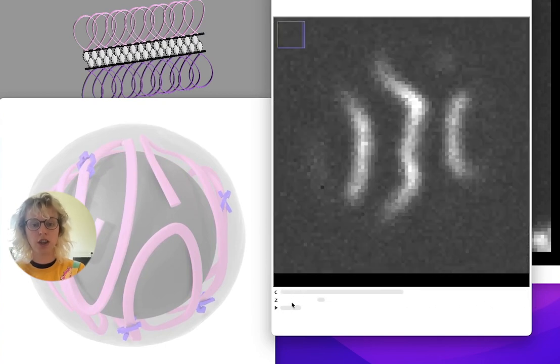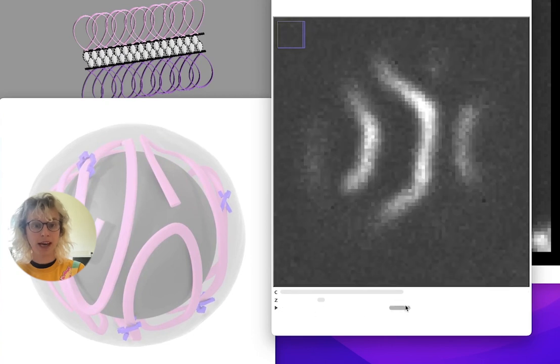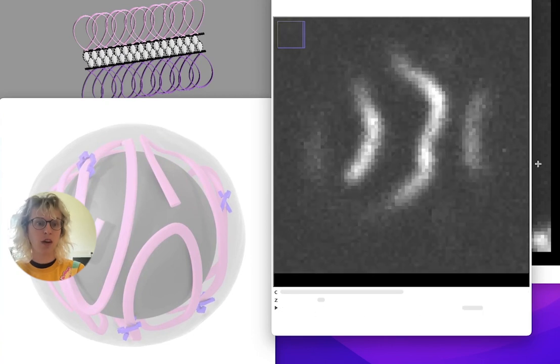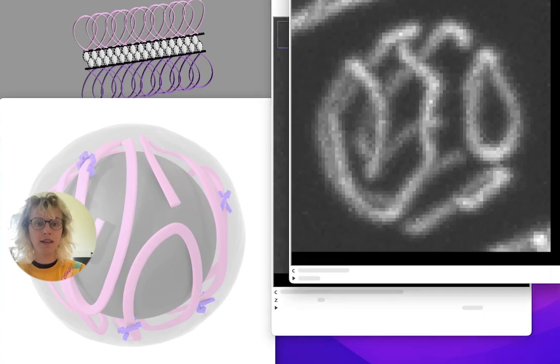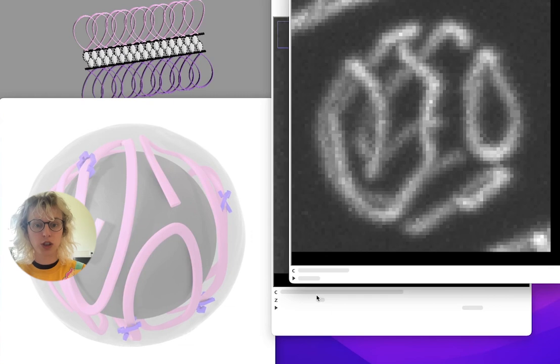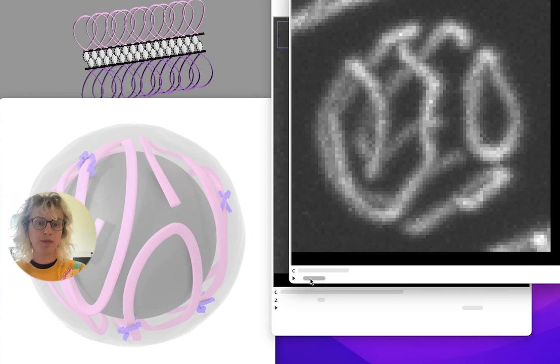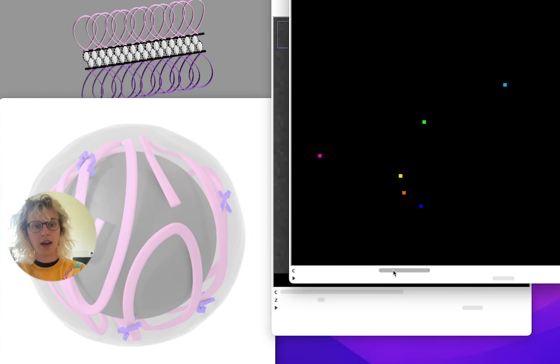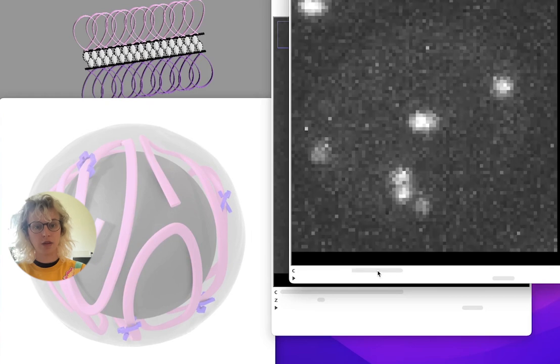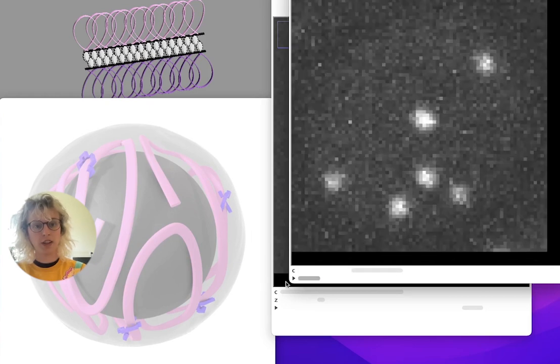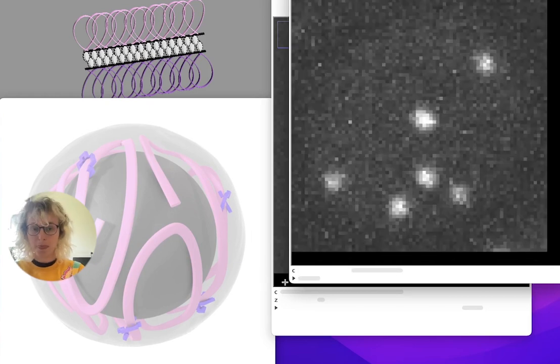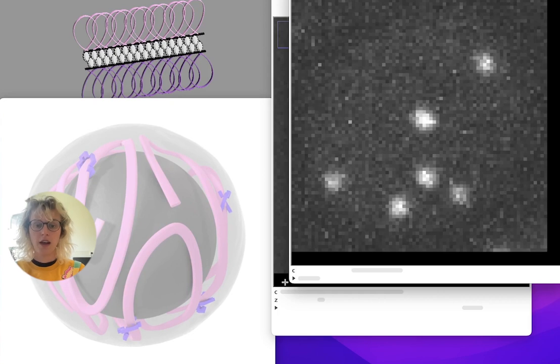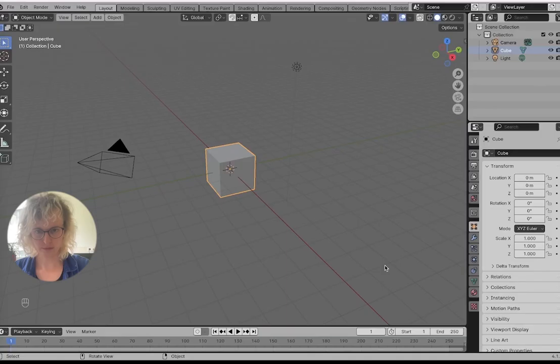And for all of this, we also have a time axis, which is maybe easier to see in the maximum intensity projection over Z. We can see our time axis, and in channel 2, we see our spots moving. So let's see how we can render this in Blender.